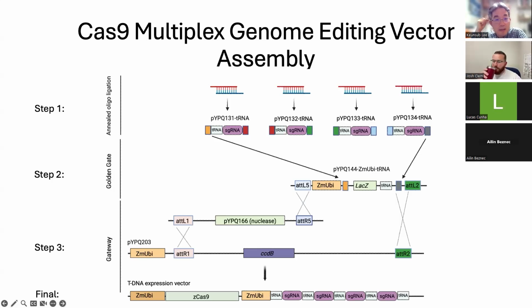Josh, looks like you have a lot of experience with different... I have one more question. Sure. Regarding the promoter or terminator we use to drive Cas9 or guide RNA expression, can you tell us more about the terminators? How crucial are they if we consider the design of a construct? Of course, we need to consider the promoter, but the terminator as well. How crucial is it compared to the promoter?